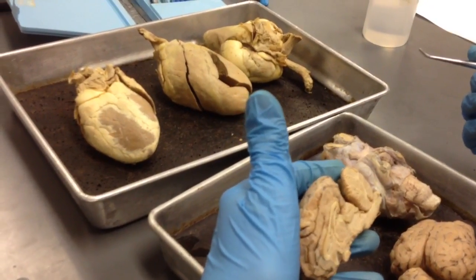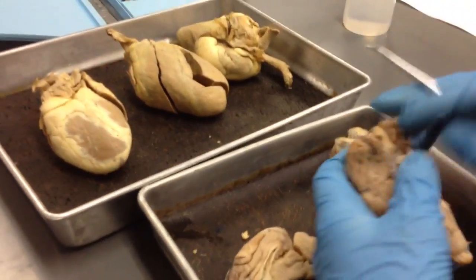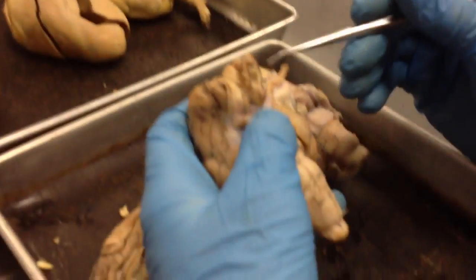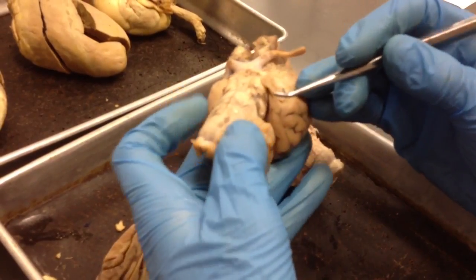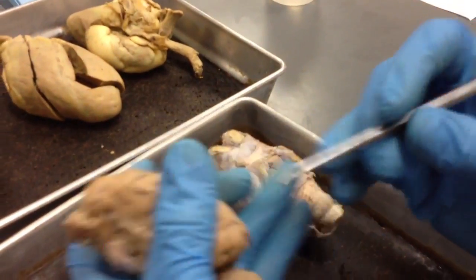Is everything already located? Oh yeah, and all the nerves. Okay. So we have cranial nerve number 1, olfactory. Cranial nerve number 2, optic. Cranial nerve number 3, oculomotor. Cranial nerve number 4 is trochlear. It's right here at the base of the transverse fissure.